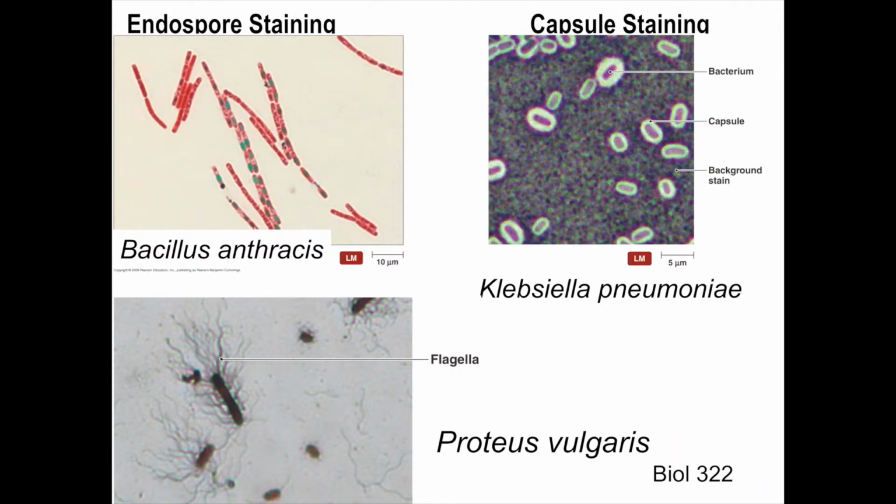That's the bottom line. And so that's why this is a useful differential stain, because it differentiates other bacteria, right? So other bacteria will not be red. So only if you have that unique cell wall that mycobacteria have, and a few others, will it hold on to that stain. And here's just a few examples.